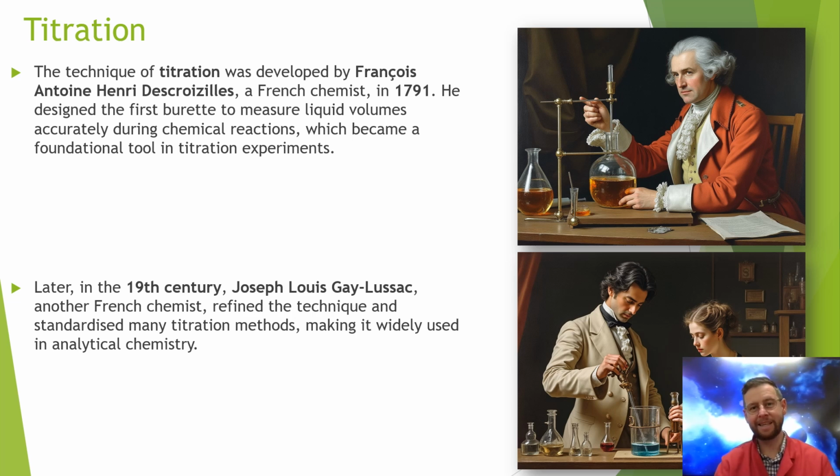So where did this method come from? Well, we have to go all the way back to 1791. François-Antoine Henri Descroizilles was the Frenchman that invented the burette, the graduated narrow cylinder with a little tap at the bottom with which you could add one liquid to another. And then fast forward over 100 years into the 19th century with Joseph-Louis Gay-Lussac, famous, of course, for inventing the third gas law. It was he that put together all of the elements that we would now recognize today as a titration.